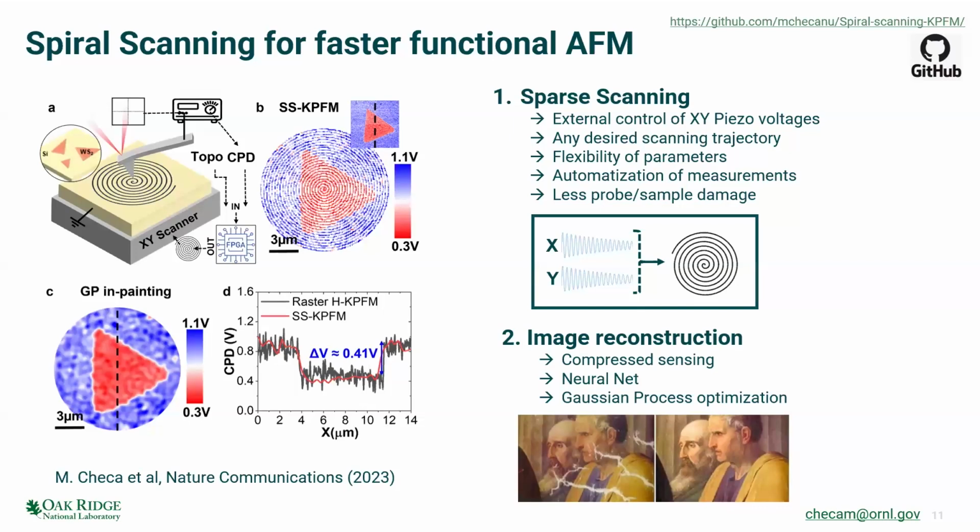This memory element, with the last part, did you try to determine the variability, the length of the interval, this reading time? Yeah, so those are very stable. They stay there for months. I haven't measured them through years, but I'm pretty sure the structure is just there. Now, as I said while I was presenting, this is very slow. It takes me a couple of seconds to write one of those structures, right?